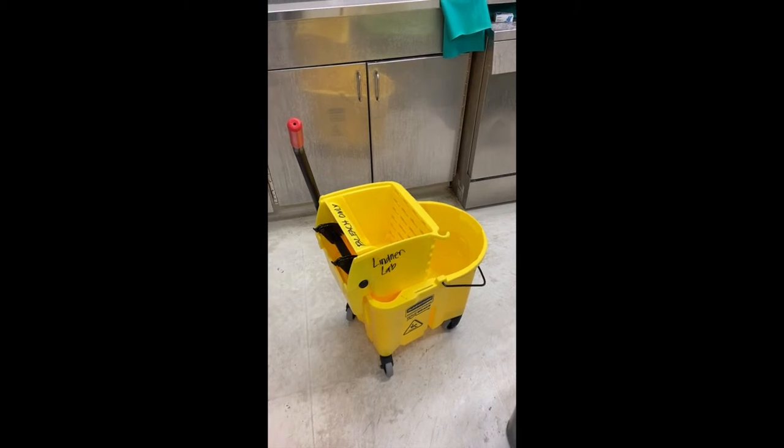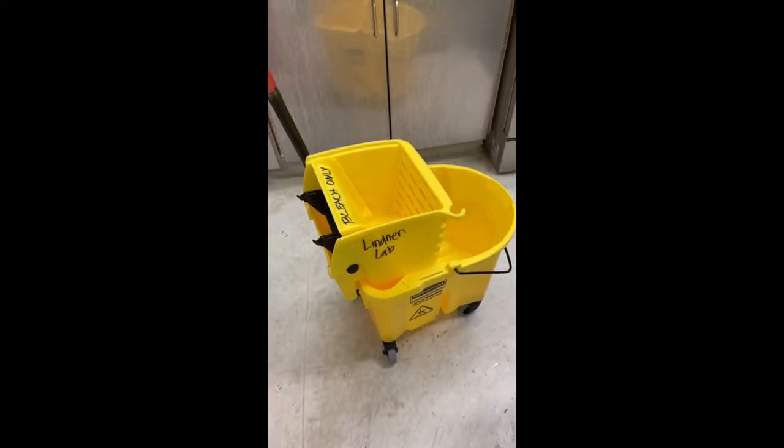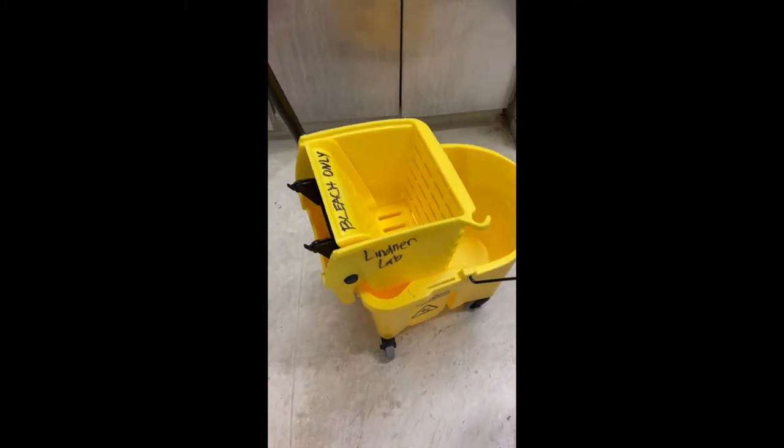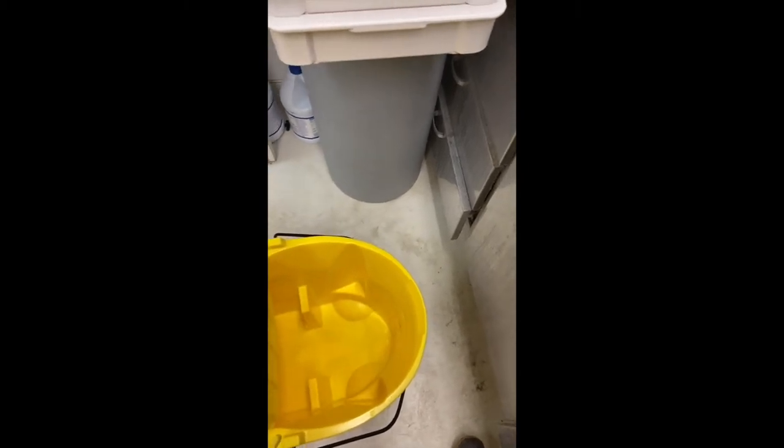To bleach and clean the floor in the combiner, we have this mop bucket sitting out in the combiner, labeled with our lab name and bleach only so that people don't put other things in it. Then you come into the auto-glaze room — under the sink is bleach also labeled with our name. If there's not bleach under the sink, there's usually extra bleach in the main lab under our bench.